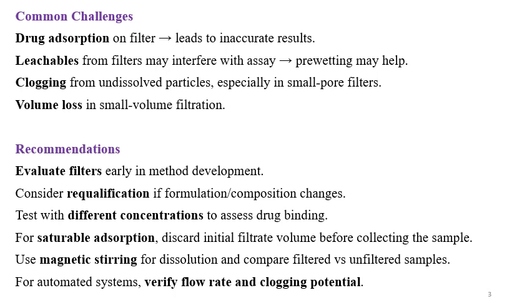For saturable adsorption, discard the initial filtrate volume before collecting the sample, so that whatever amount is adsorbed, that filtrate you are not going to use for the testing. You will use the fresh sample from which there is no adsorption or very little adsorption, if any.